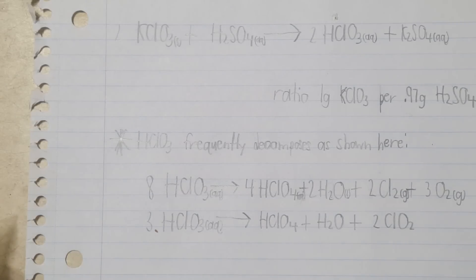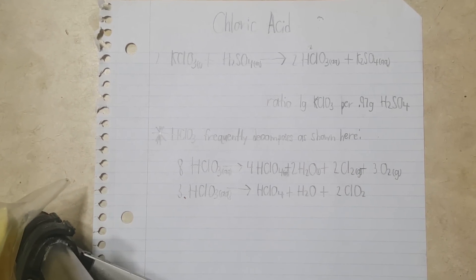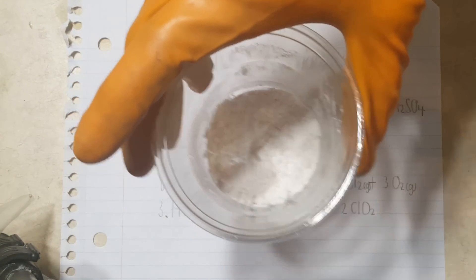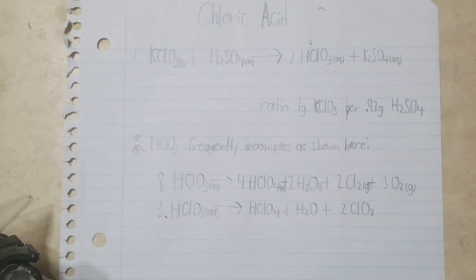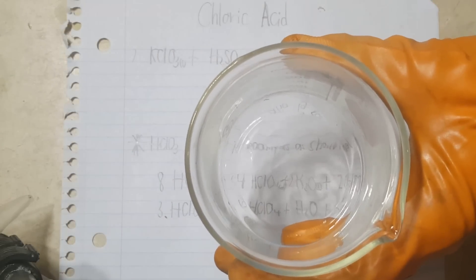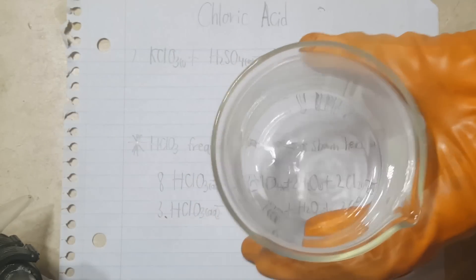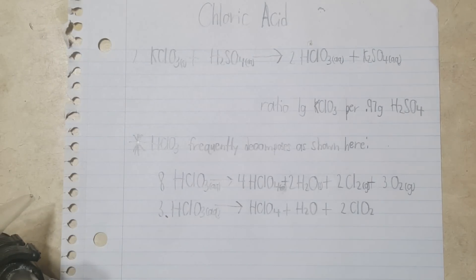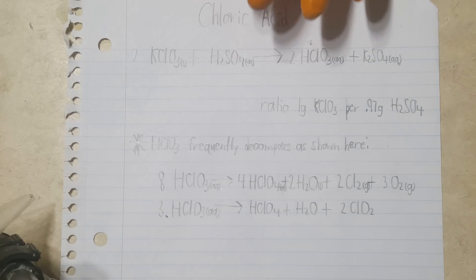So let me show you the chemical equation we're dealing with. What I'm going to be doing is reacting potassium chlorate — this white salt right here — with concentrated sulfuric acid. I have a few milliliters in here. I don't want to make very much of this solution. It's nasty stuff. Potassium chlorate reacts with sulfuric acid to make chloric acid and potassium sulfate.